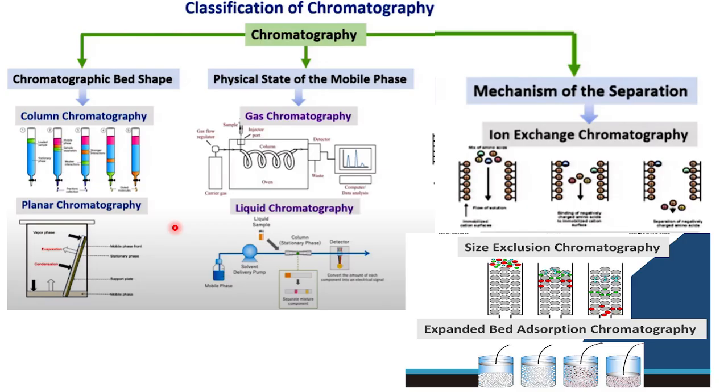So in the case of polymers, size exclusion chromatography is based on size, on the macromolecule's different chain length, and it will separate different polymers.